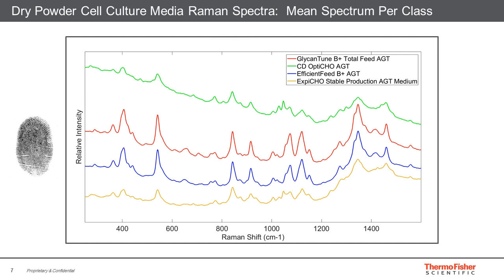Note the blue and red spectra show differences in relative magnitudes of their peak intensities, while the green and gold spectra display the presence of some potentially different constituents. The slight differences in these pairs of spectra are, again, the reason why we utilize TrueTools to increase the signal-to-noise ratio and extract the finer details with classical chemometric approaches.